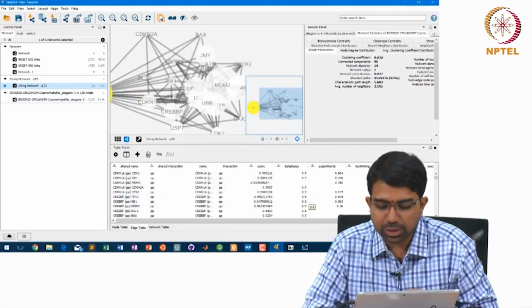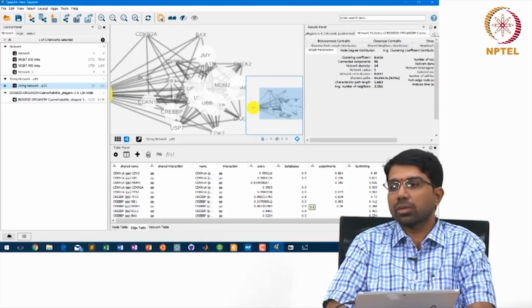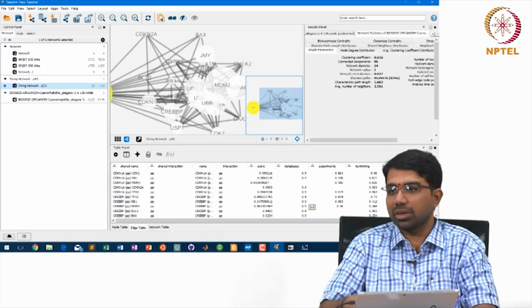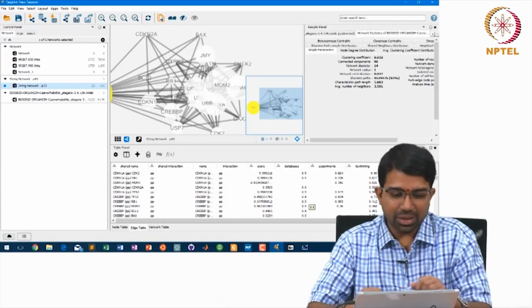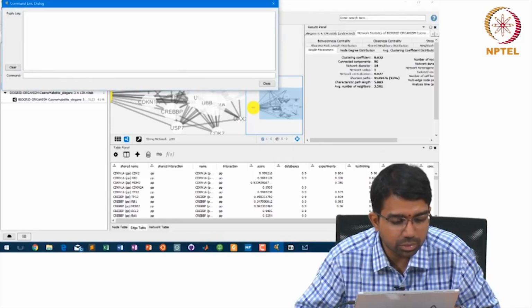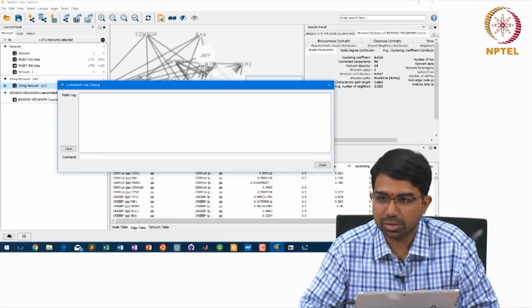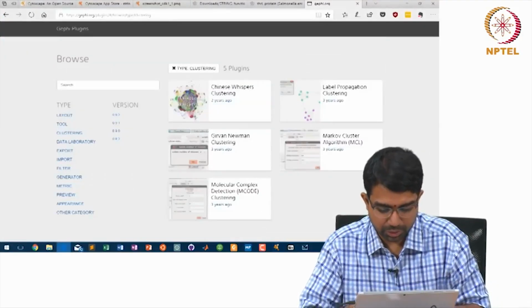There are also a few things you can do in a programmatic way as well with Cytoscape. So, that is quite useful as well. You can access several of the Cytoscape commands programmatically. I think there is also a terminal and so on. So, there is a command line dialog where you can do several things. So, and I think CyREST is also useful.